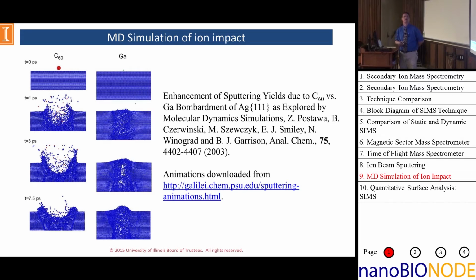And this is from a top-down view. I'd like to go back and redo that just so you can catch the ion that comes out going this way. Boom. So all this atom motion just from hitting the sample. So now the second thing that we'll look at is if we use C60. The idea here being that we have less energy per atom that's hitting the surface.